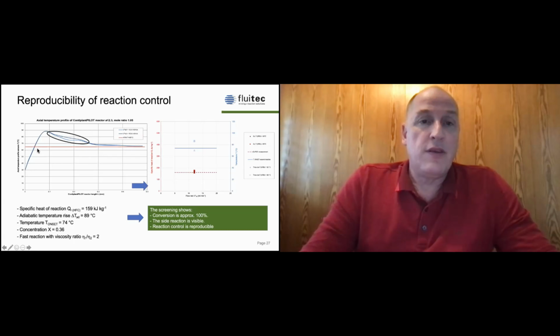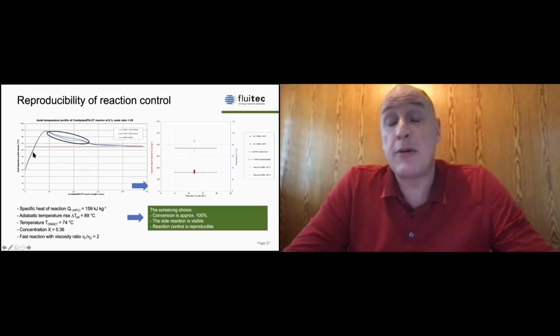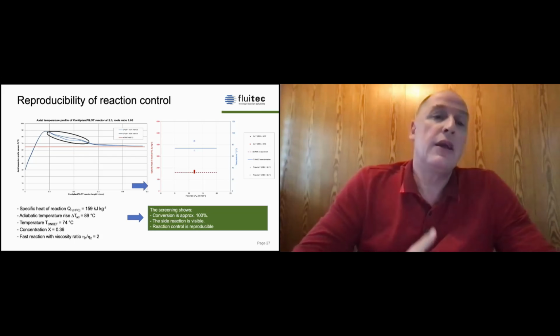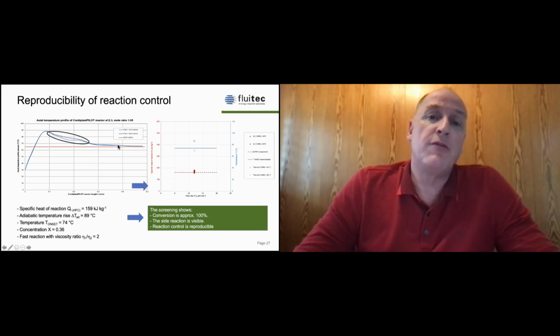This is an interesting picture of a reaction. We wanted to know about the reproducibility of these reaction systems. Can we reproduce the reaction, same flow rate, same temperature? We were running the temperature, so the exothermy was working quite good. But here we just saw something, and this is quite interesting. We call it the shoulder.